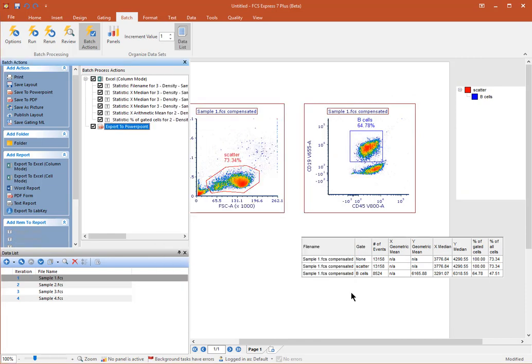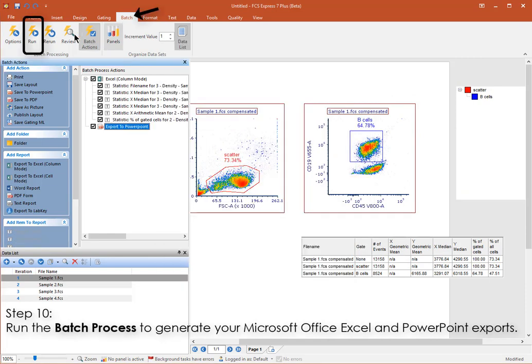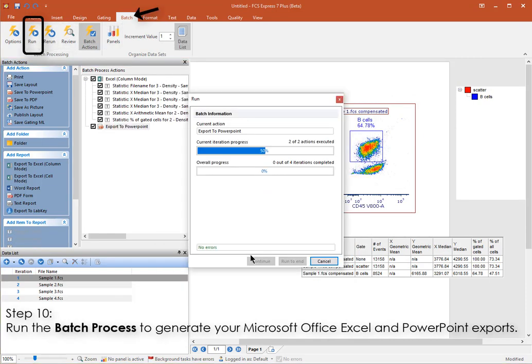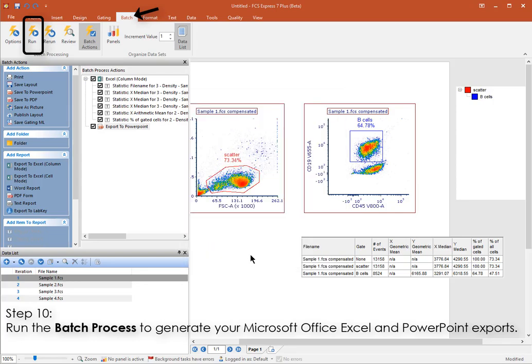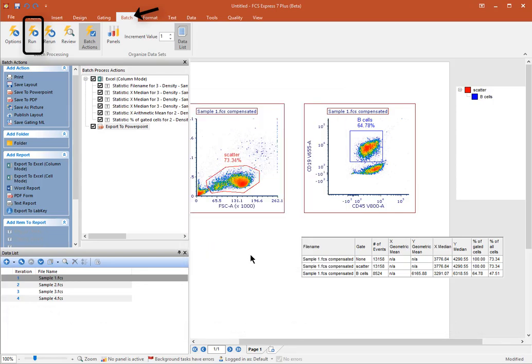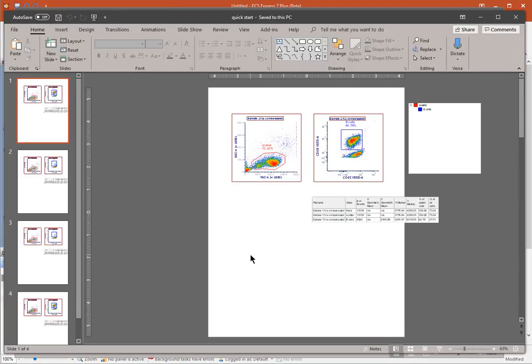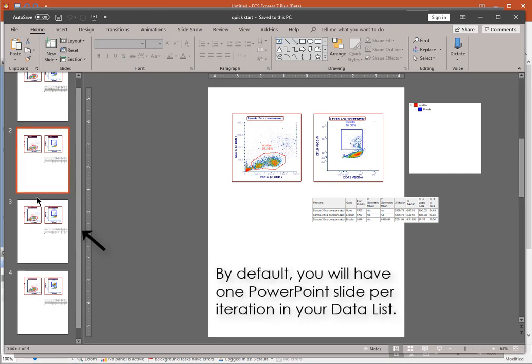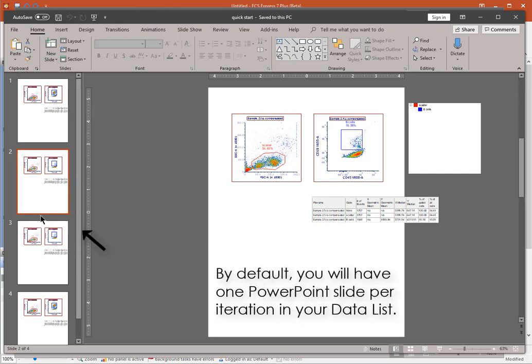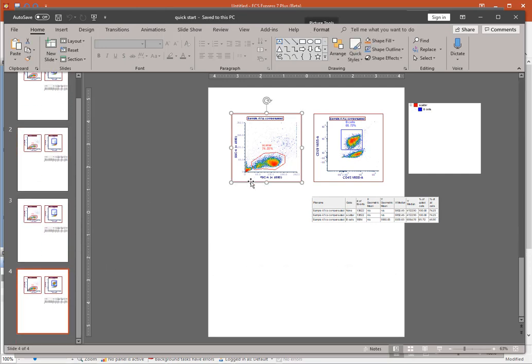We're now ready to run the batch process. From the Batch tab, click Run. All the data files in your experiment, which are viewable within the data list shown earlier, will now be processed and summarized in visual and statistical form. Open your PowerPoint and Excel files respectively to see.